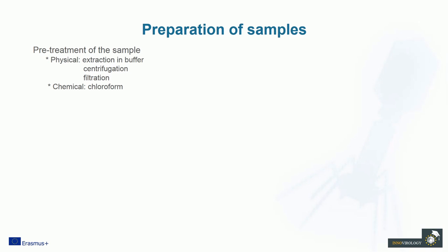This involves the incubation of the sample along with the desired host in liquid culture, often overnight depending on the host, to amplify any phages in the sample. This will result in a higher concentration of desired phages in the sample that would allow for easier isolation.